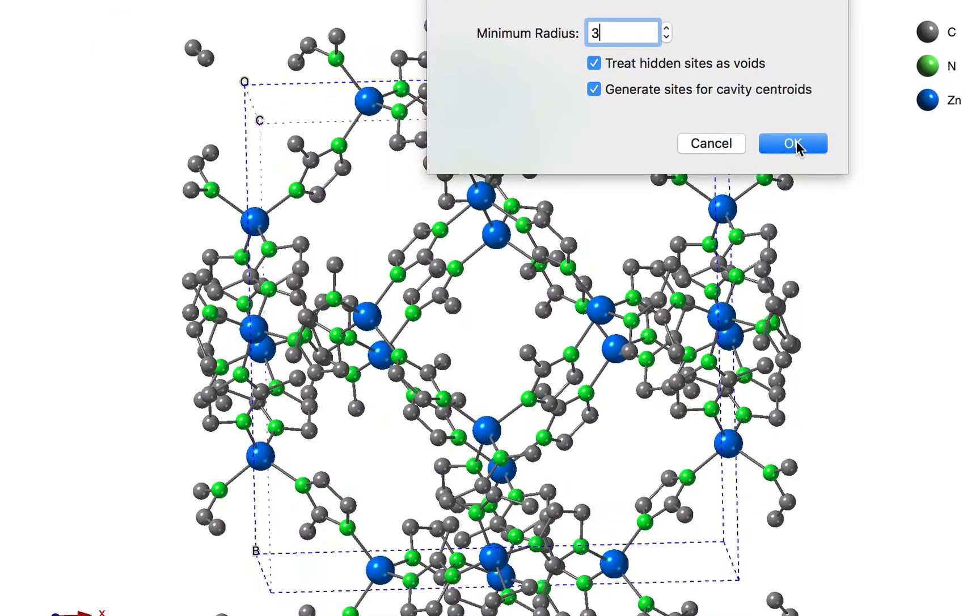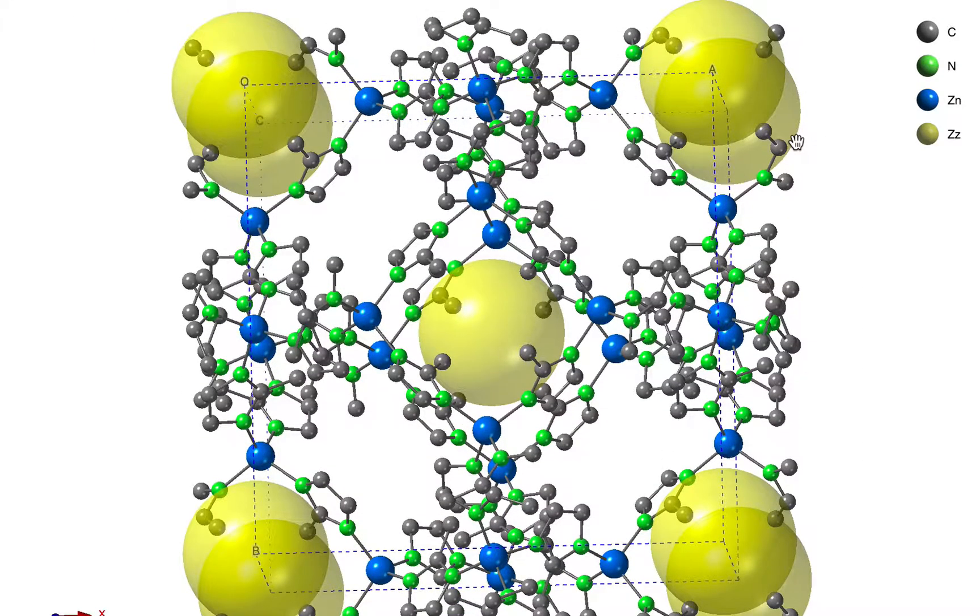If we click OK, CrystalMaker figures out where the cavity is in this structure and puts a dummy atom of the appropriate size in the center.